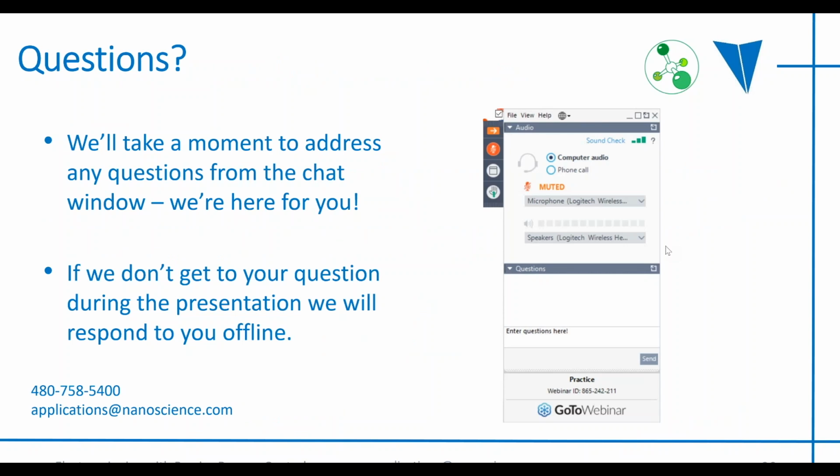Okay, now we have time for some questions. I do have quite a few questions that came through after that last break. For the first question, Tom, I have for you. Fire away. What is the material quantity range needed for the LE10?